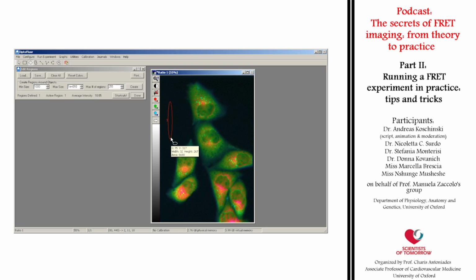Therefore I can now create the first region by using the rectangle or ellipse tool. Make sure that this area in fact contains only background. Click on the area, then click and drag to increase or decrease the size of the ROI. Create some more regions on the cells. These are just for the preliminary online analysis, therefore they must not be very precise. However, if you would like to outline the shape of a cell more accurately, you could also use the Polygon tool. Close the shape by double-click.